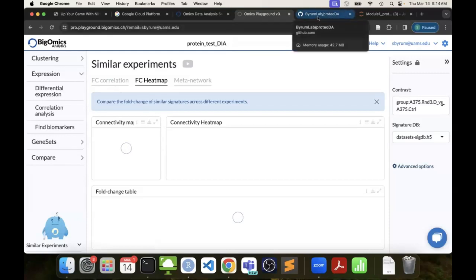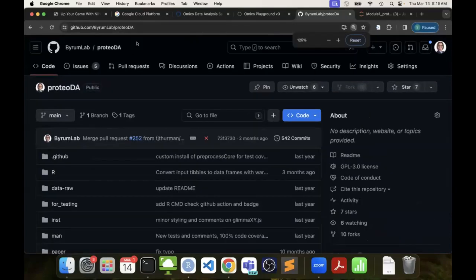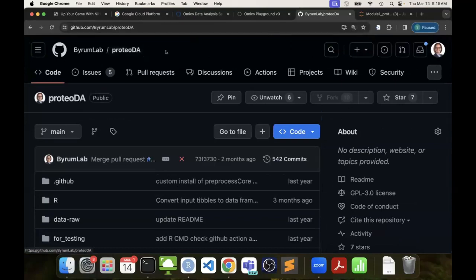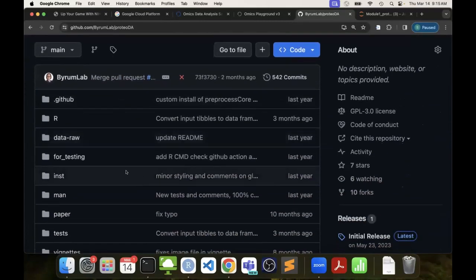Okay, so GitHub. Who all is familiar with GitHub? Few? Sweet. So GitHub is kind of the repository where all of our free tools exist. And I learned a lot about GitHub last year, pull requests, issues, all these different things. So what's nice about this is you can have a team of people working on a project and we submit into this repository that's online. It's freely accessible. All of our R-code, everything that is part of this package is in this repository.